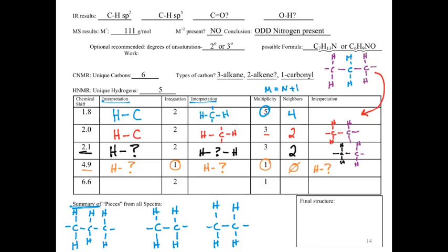We have no idea what that hydrogen is bound to at this point. That chemical shift falls in kind of a dangerous region. I would really avoid trying to interpret it. So we can now put in yet another piece, a hydrogen bound to our question mark. And then our very last signal, what color have I not used? Let's go with green.